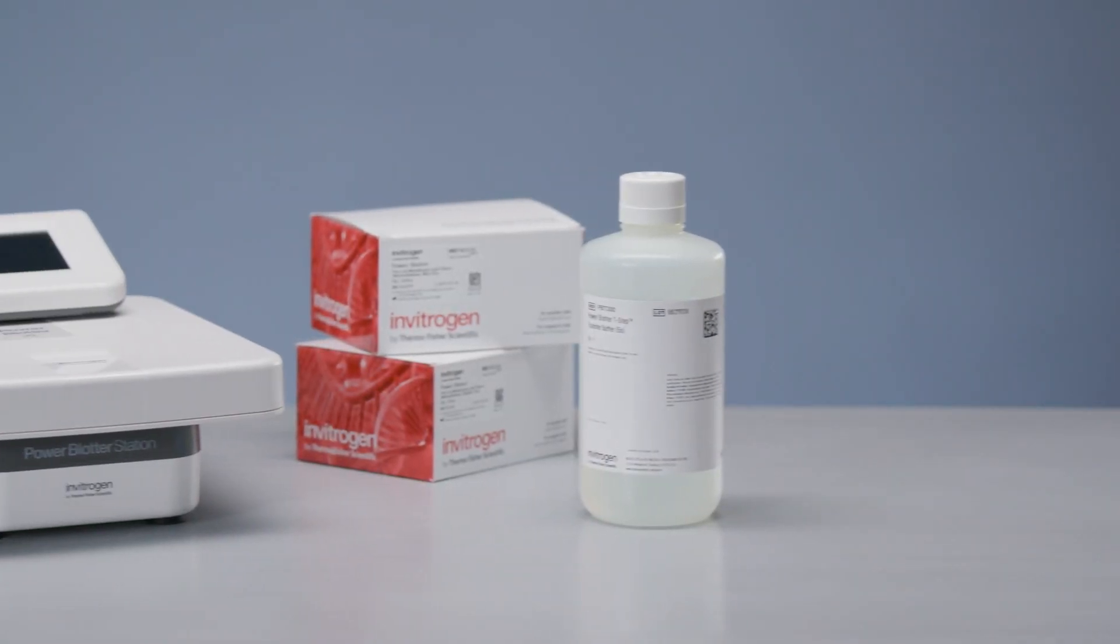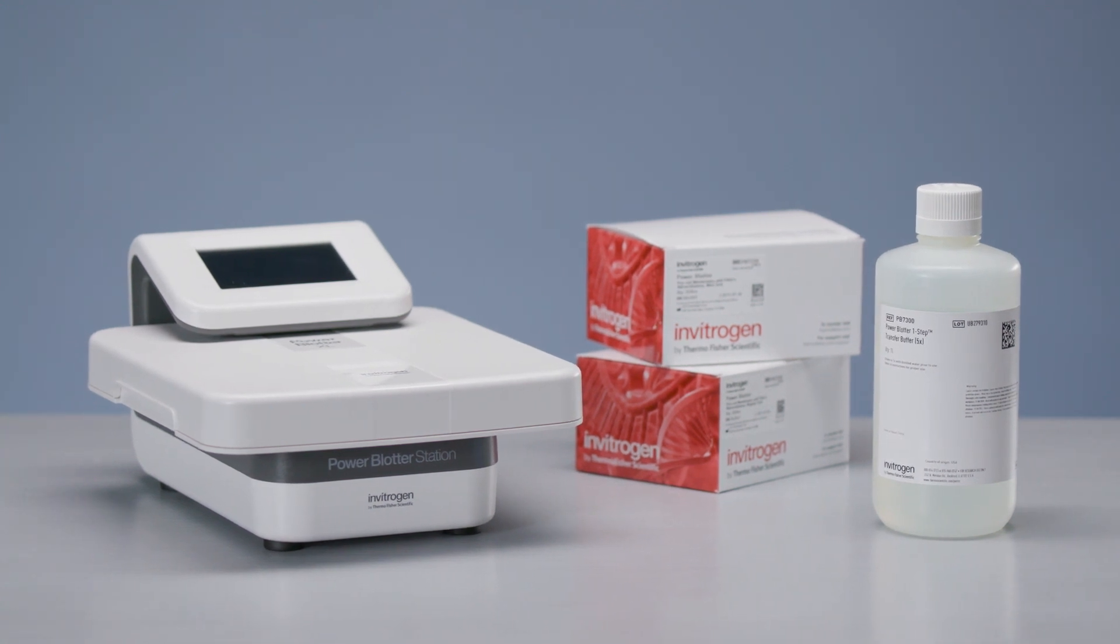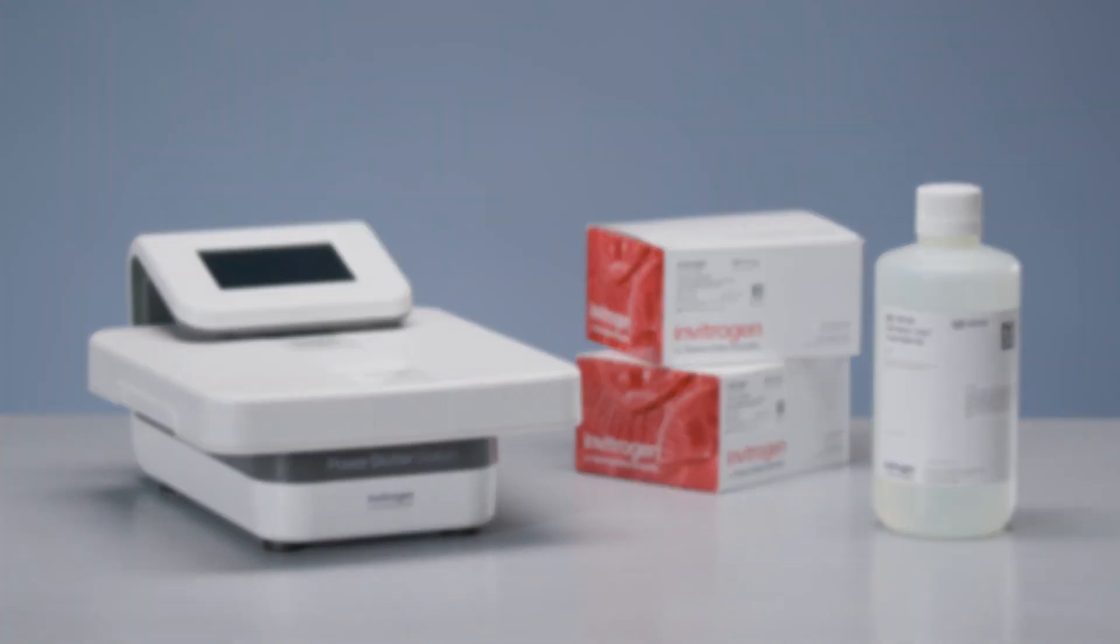The Power Blotter One-Step Transfer Buffer is an optimized high ionic strength buffer that facilitates rapid transfer conditions when combined with the high current conditions of the Power Blotter system. Filter papers soaked in the One-Step Transfer Buffer act as an ion reservoir. The system can also be used for standard semi-dry transfer protocols that use traditional buffers.